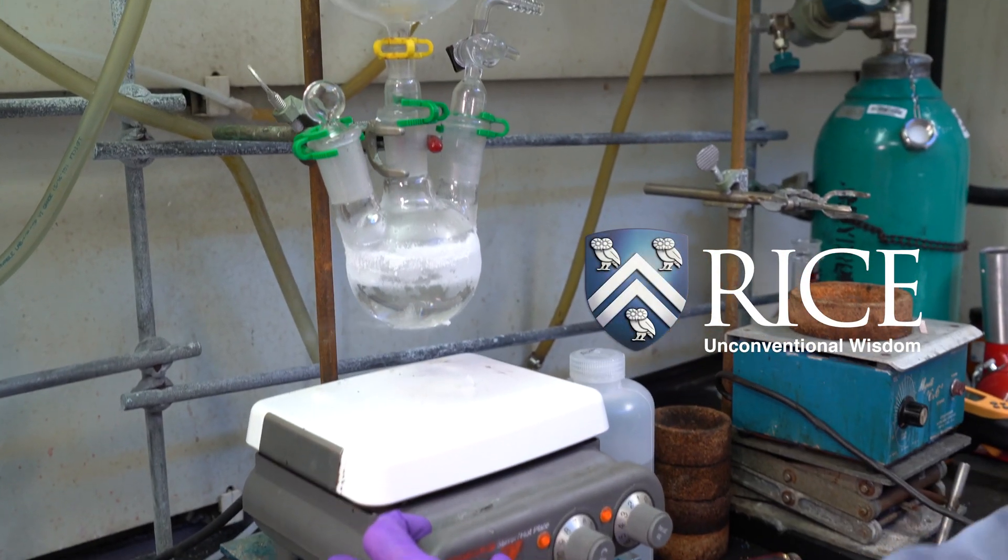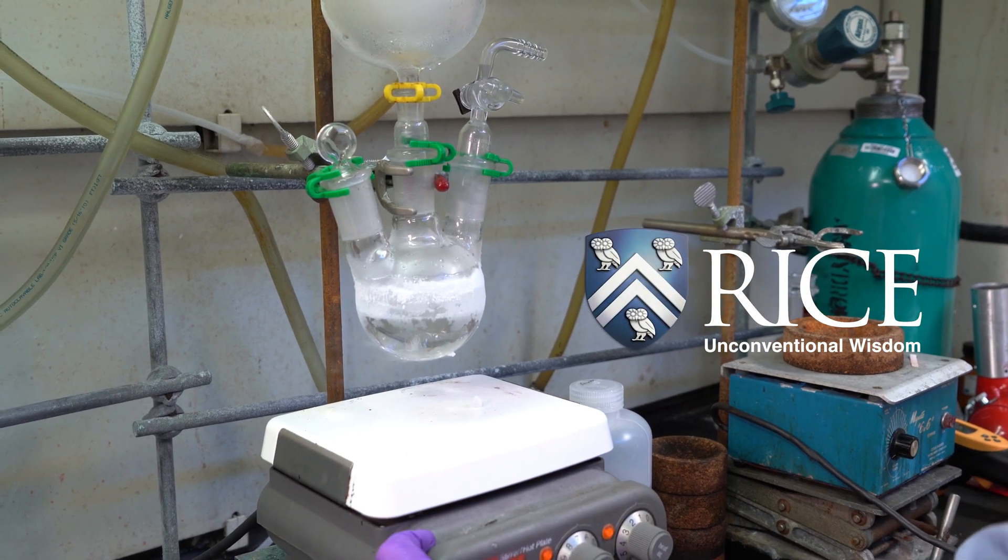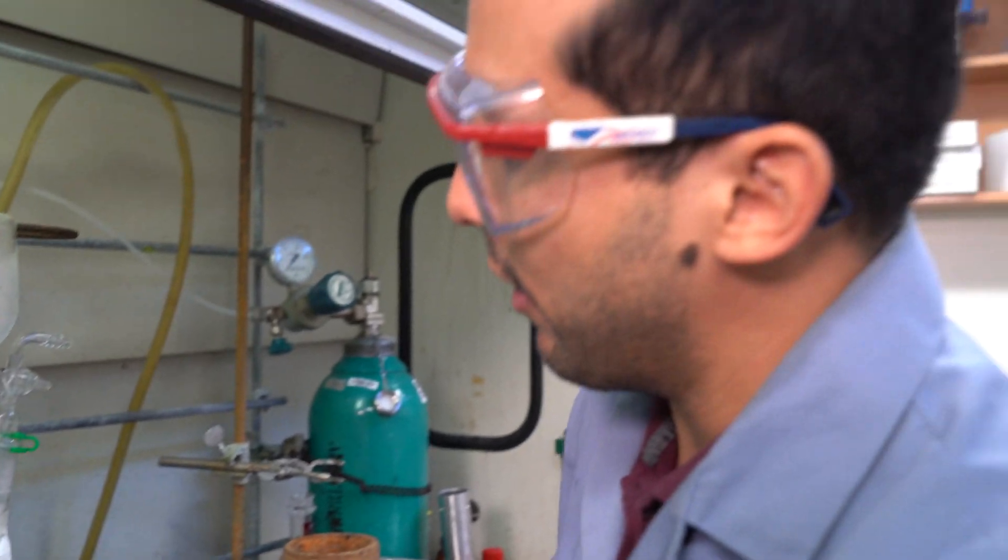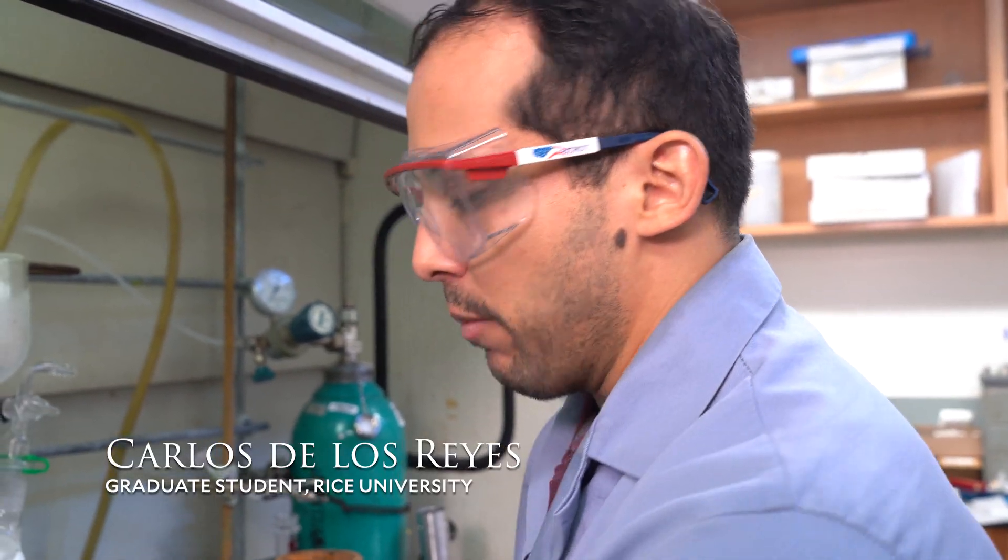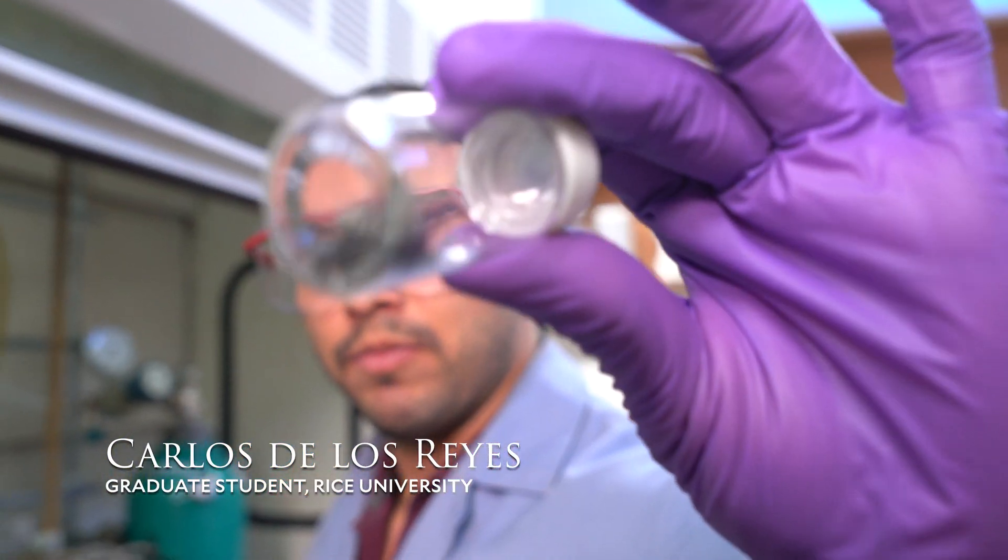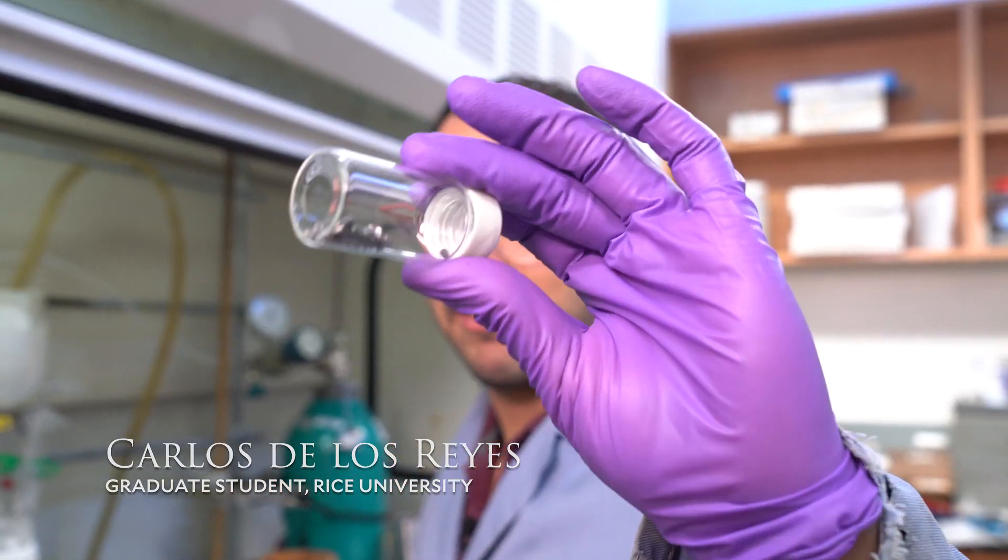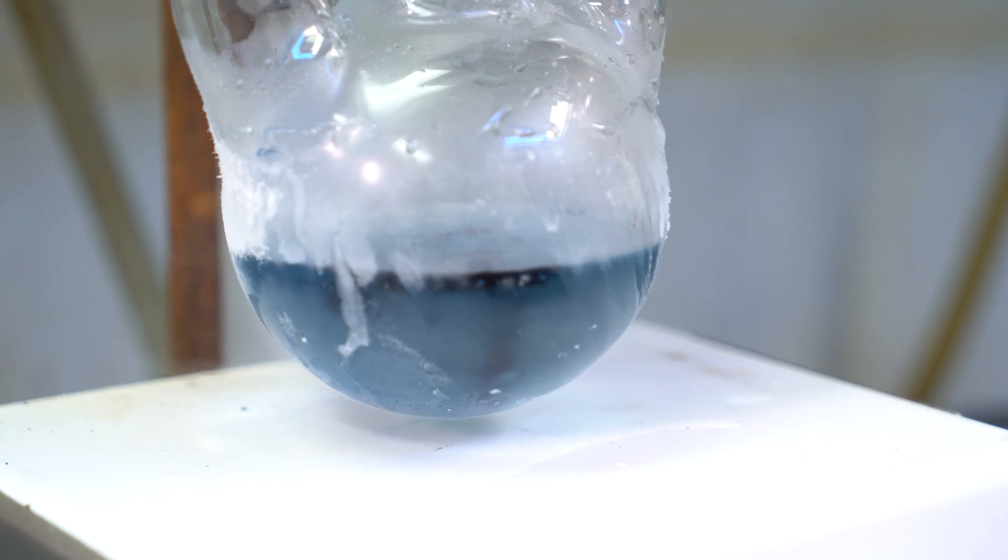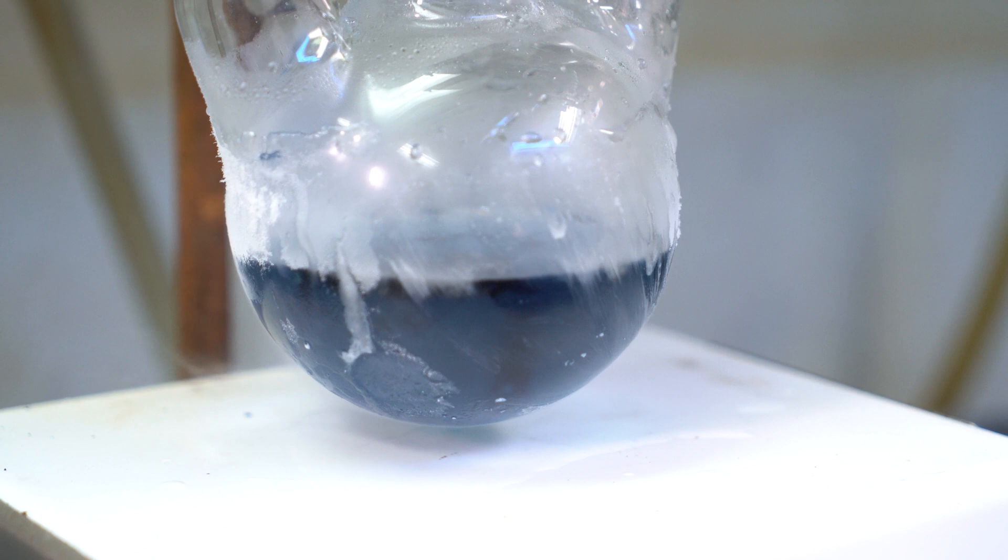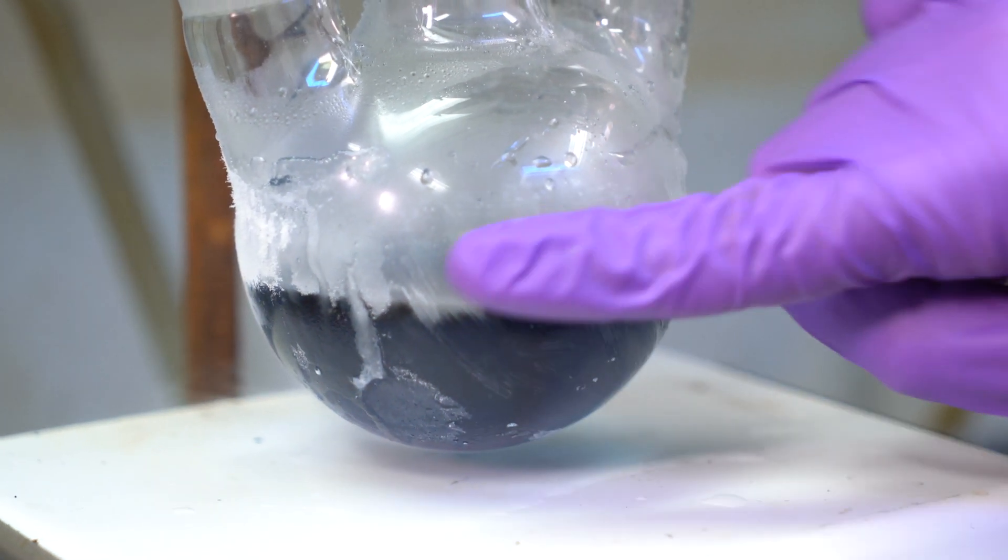Right now we have ammonia inside and it's crystal clear. I'm going to use this lithium, which is shiny as any other metal. It will create a blue solution where electrons will be solvated by the ammonia.